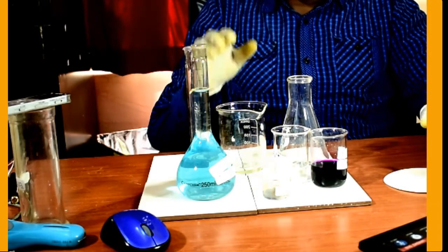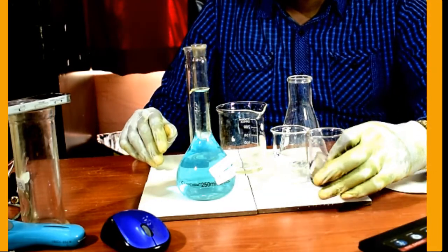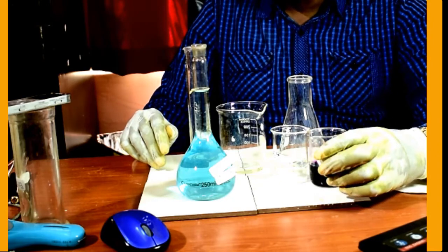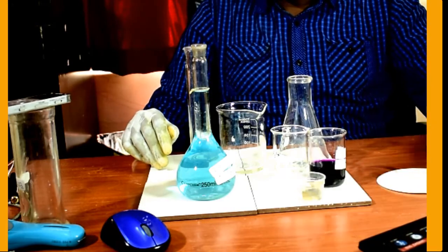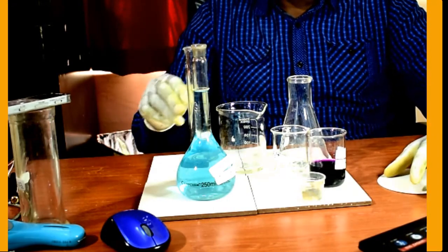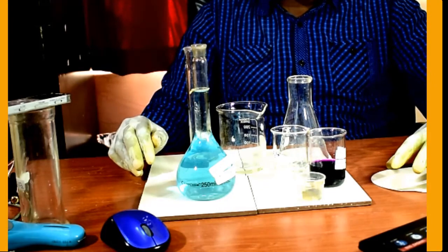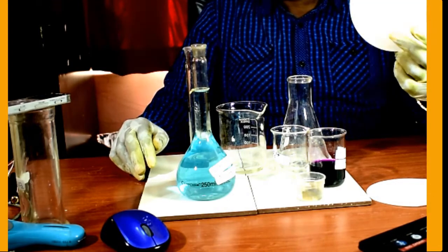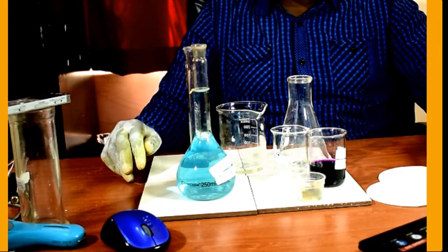The reaction will produce copper metal, and there will be excess iron, and I'm going to filter the two so that I can have a pure solution of iron 2 ions. So I will use the filter paper and a filter funnel to do that.